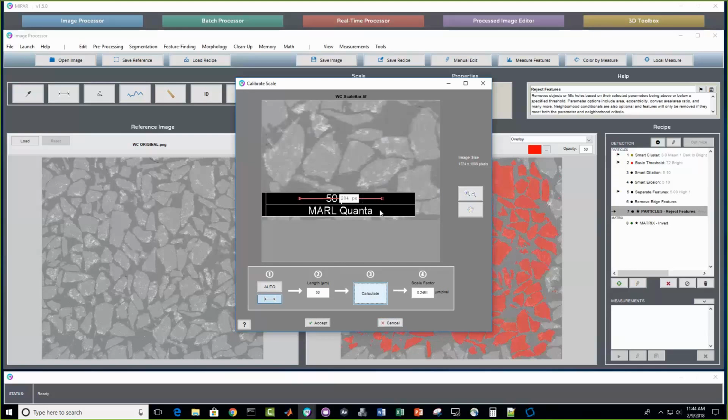We support all kinds of bars. As you notice, this split bar works. Certainly long connected bars work just fine. Even hash bars that are seen on Hitachi SEMs, where you've got 10 different hashes that span a total distance, our algorithm works with those as well. So we're very excited about the reduction in that unnecessary uncertainty that this provides.